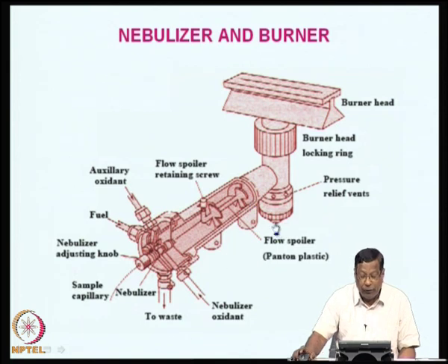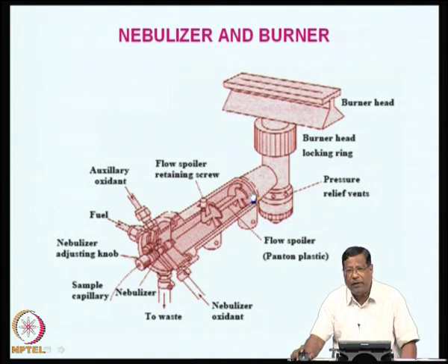And usually the nebulizers have about 15% efficiency.